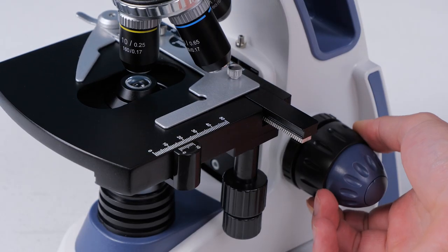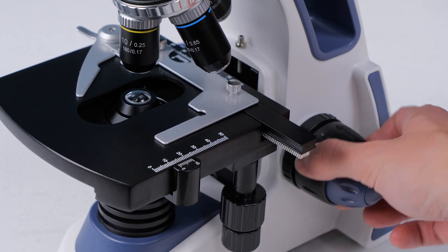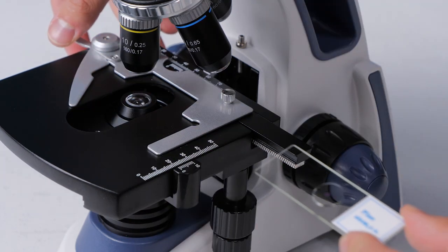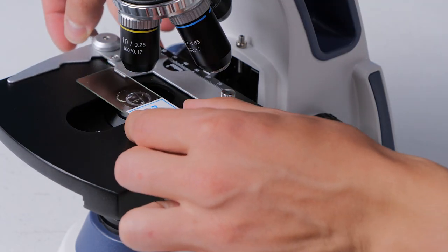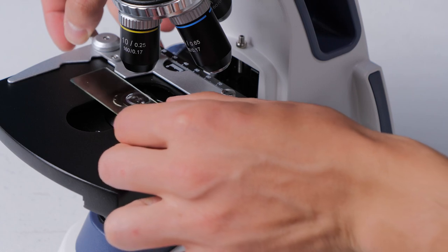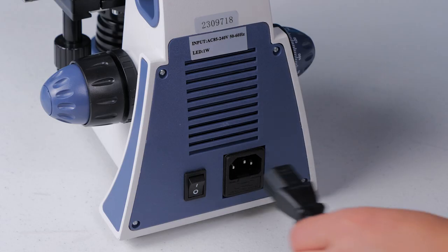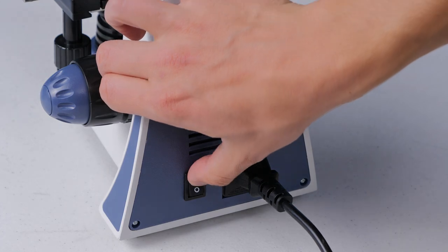This is the coarse focus and this is the fine focus. Use the coarse focusing knob to move the stage all the way down and put one of your prepared sample slides onto the stage. I like the pine stem. Plug in the microscope and turn on the transmitted light illumination switch.